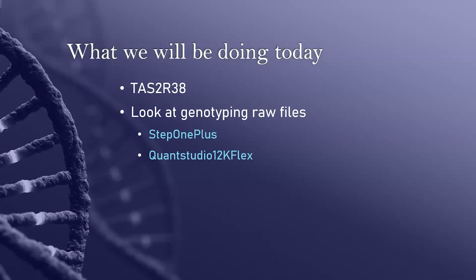The 12K Flex is a little bit bigger and can do more experiments with different plate sizes, and the StepOne Plus is more limited to 96 well plate experiments, and it can't run things like microchips, for example. The StepOne is a little bit older, and it's less exciting to look at, but it's an old reliable in our lab, so we still use it.